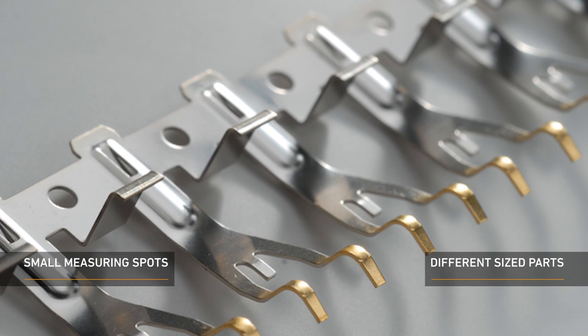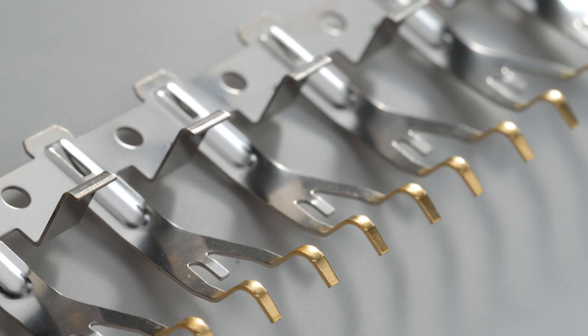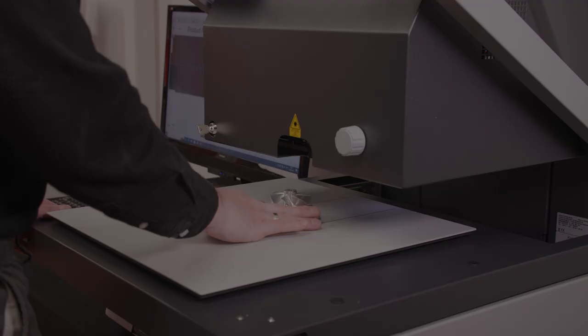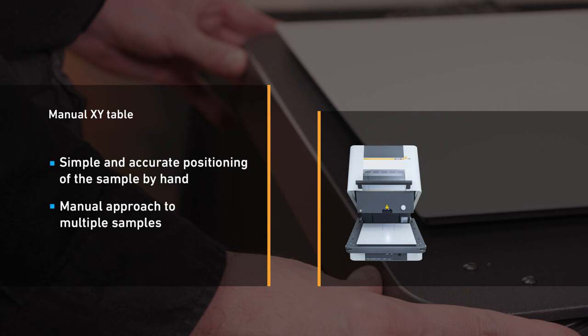With this instrument, the smallest sample size measurable is 0.3mm, making it perfect for measuring small areas on items such as connectors.